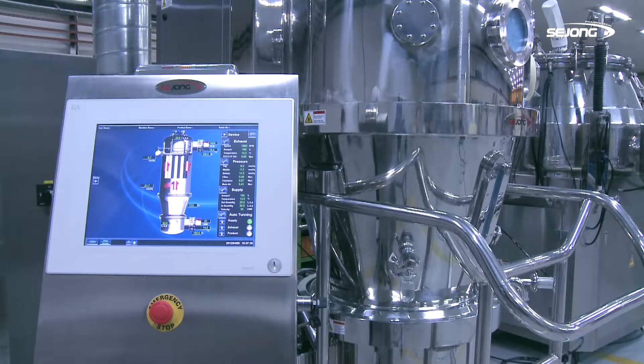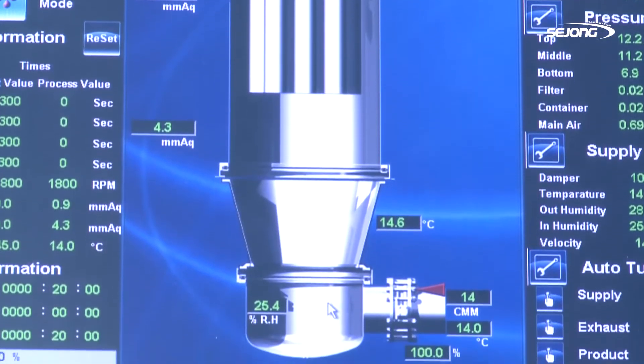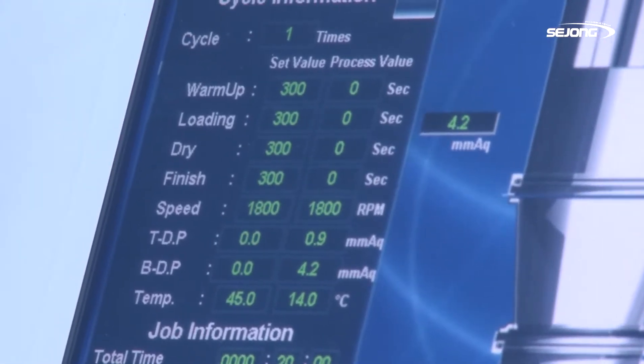The user interface has been designed realistically as if the operator sees inside the real machine. To maximize the convenience of the operator, it shows much information and the current condition neatly.